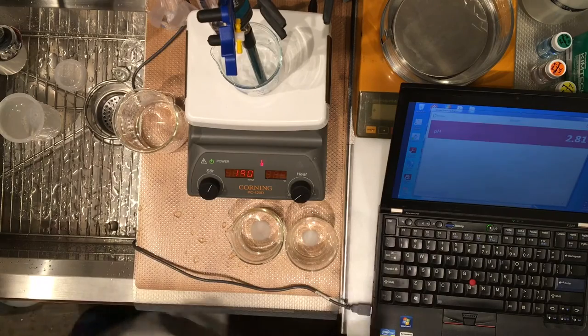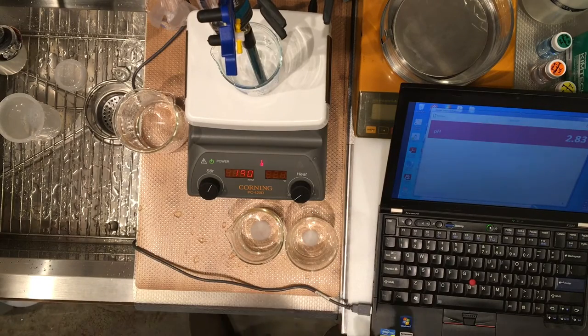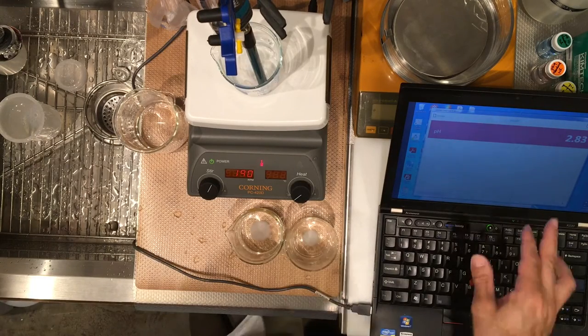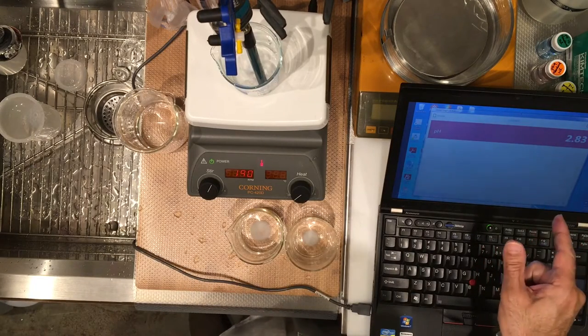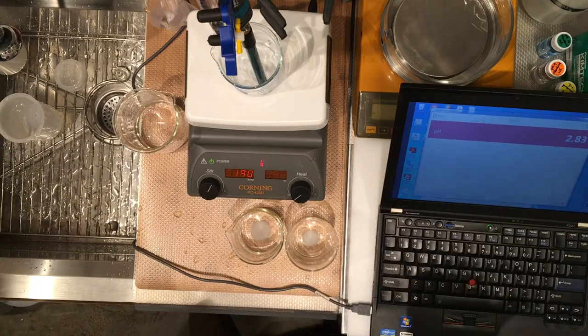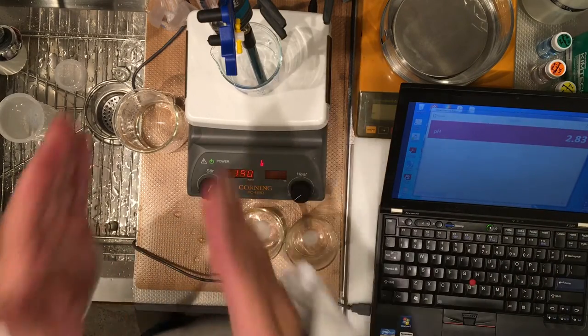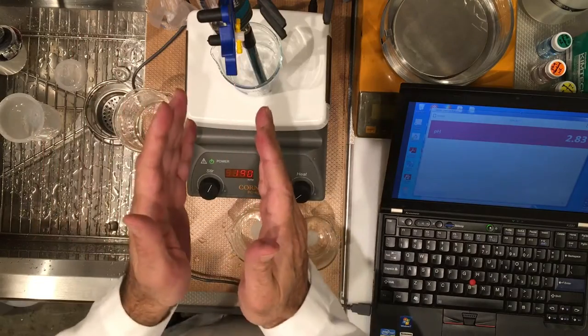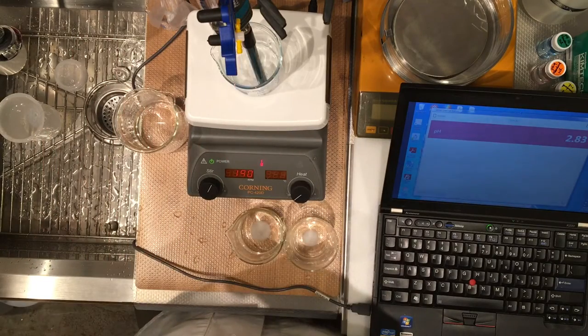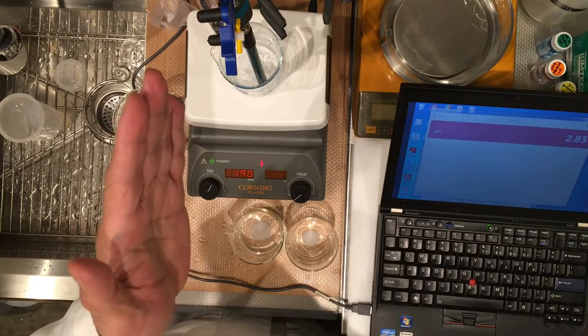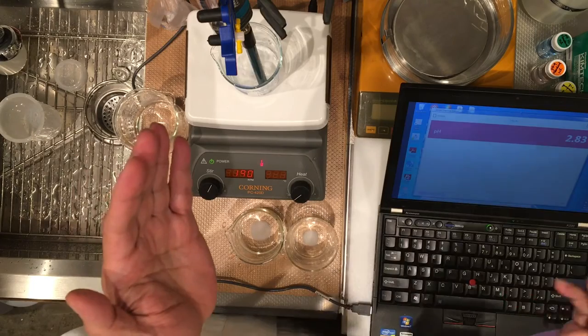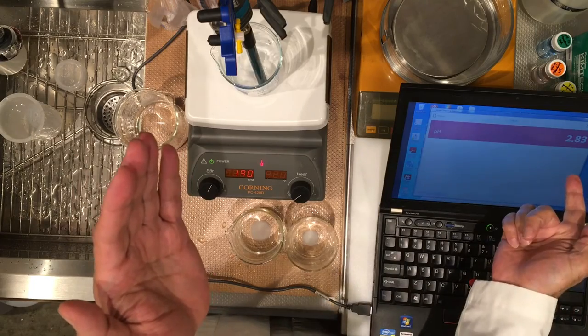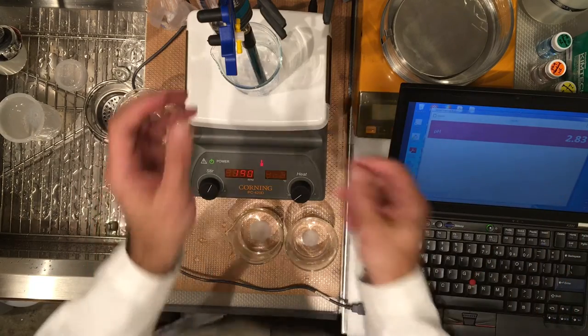So, please record each value. Wait till it stabilizes, and then record it. Like right now, it's good. You can record it. And then I'm going to just call out the volume. So, wait till I call out the volume. And then you can go ahead and wait till this stabilizes, and record it. Okay.